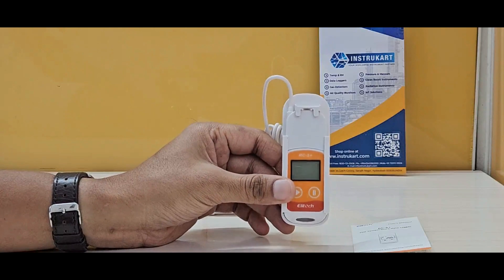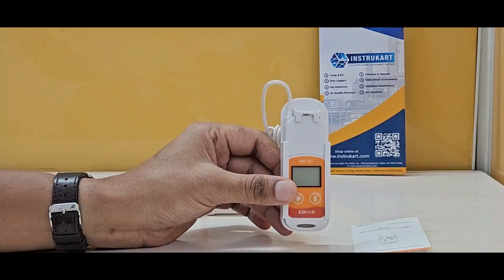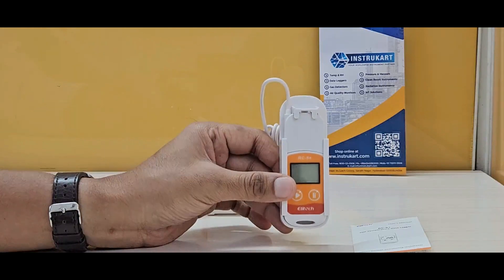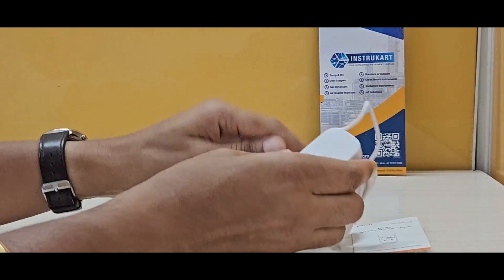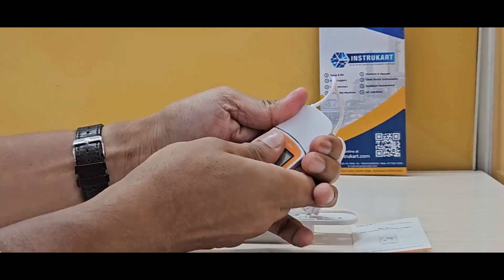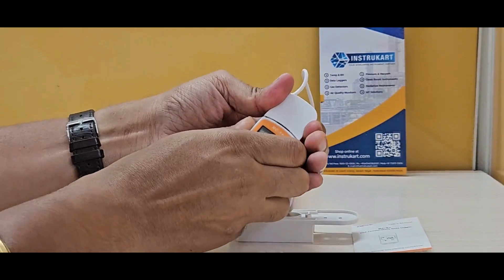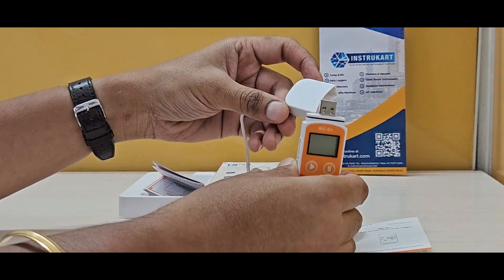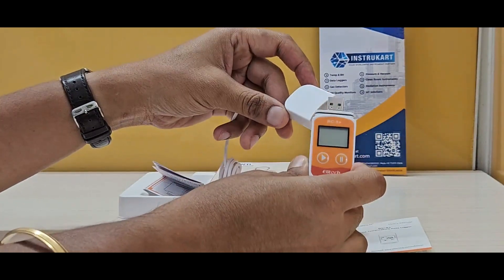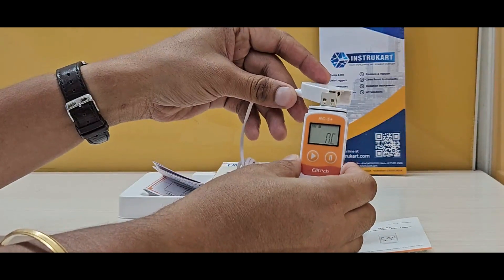It has a recording capacity of 32,000 entries and communication via USB 2, meaning you can connect it to a PC. The USB is detachable and can be plugged into the PC to retrieve records from the data logger.